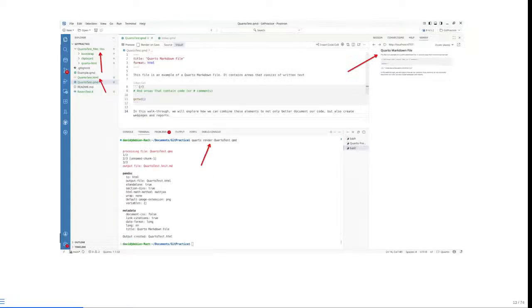So we get a similar result to what we were seeing previously using that little preview tab option up here. When you do this, you can see we have the .qmd file for Quarto test, but in the process we have also generated a Quarto test.html document that's present, and all the extra metadata associated with the file gets placed within the Quarto test files folder.